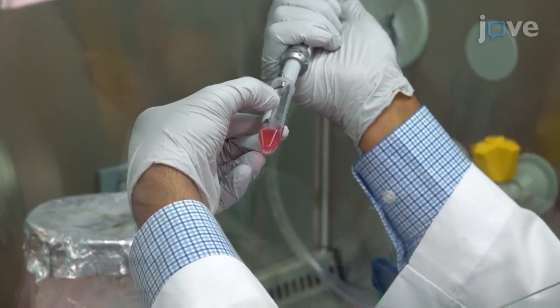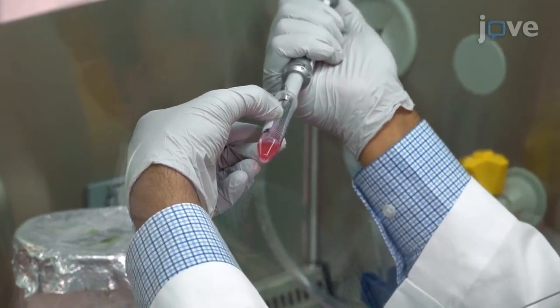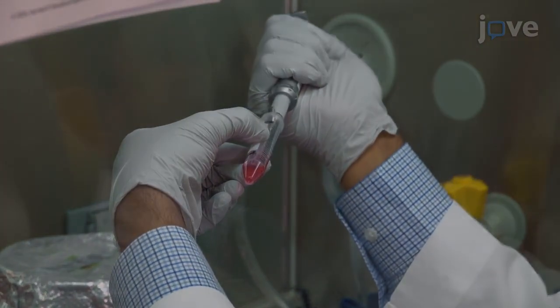After each treatment, pool the electroporated cells from each condition in individual 5 milliliter aliquots of fresh culture medium.